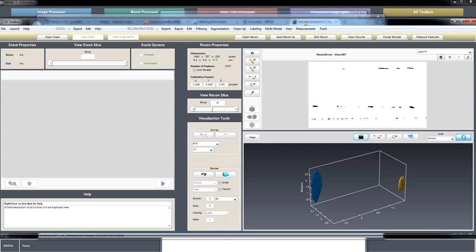So that's going to do it for me today. Like I said, if you want any of the recipes that were built, I'm sure you could recreate them from watching the video and adding the steps, but we should be able to, once I clear any requests with the folks that distributed the images, send any out that you need.